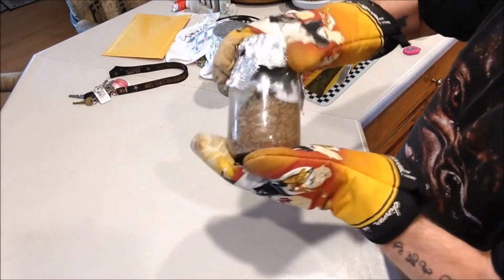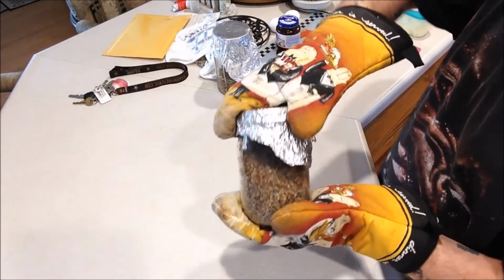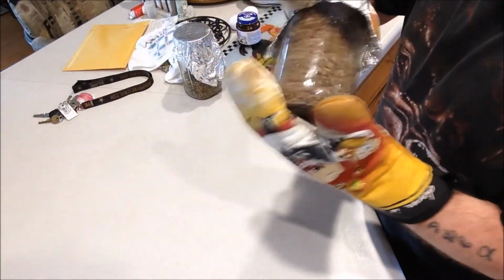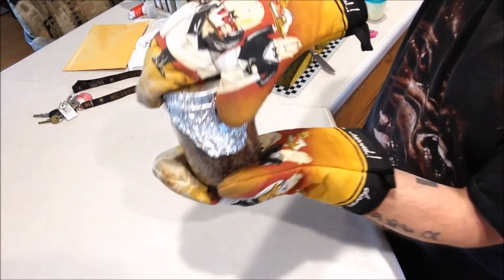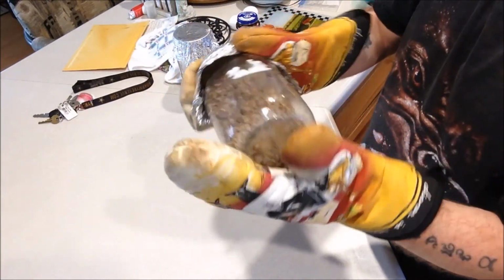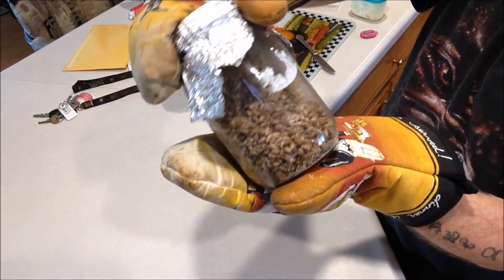All right. It's important at this phase to give it a good shake. So you'll see at the bottom some of the grains will clump up a little bit. A little bit of gypsum got stuck on the bottom. That's no big deal. And there you go. Perfectly hydrated and ready to go.